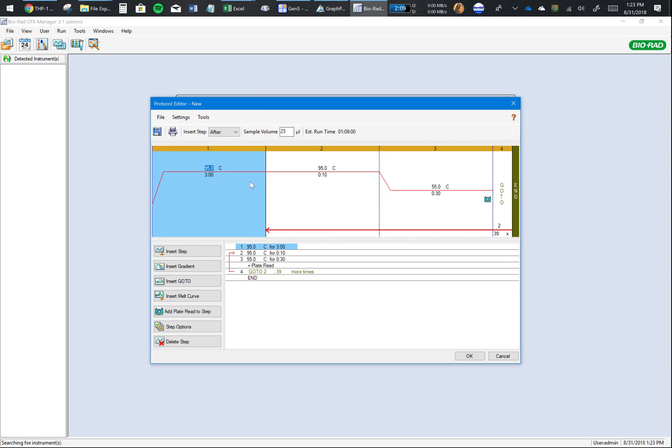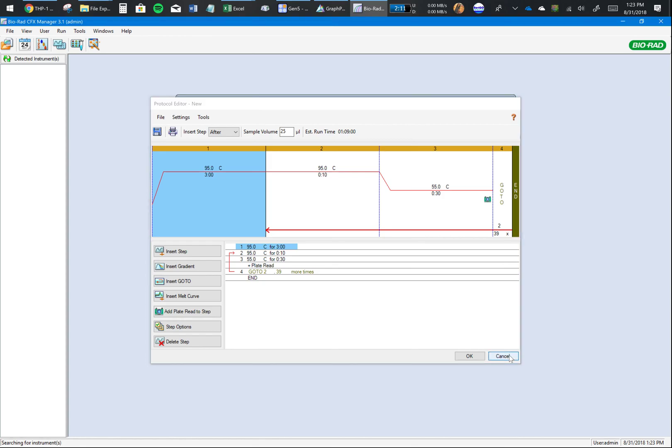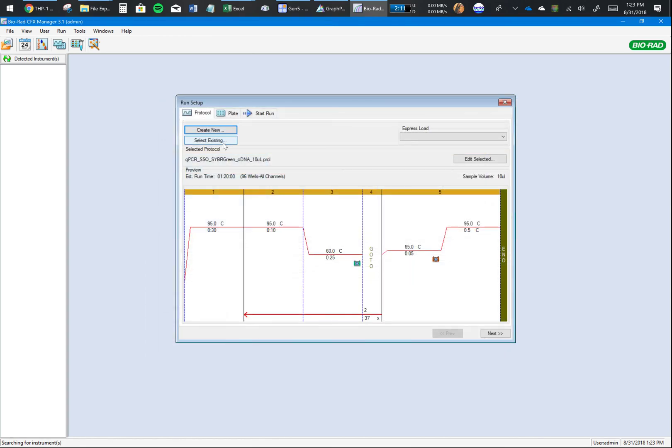Here are all the settings you can change. Make sure you read the manual that came with your SYBR Green kit, and the manual would tell you what all settings need to be put here. For now, I already have a protocol.